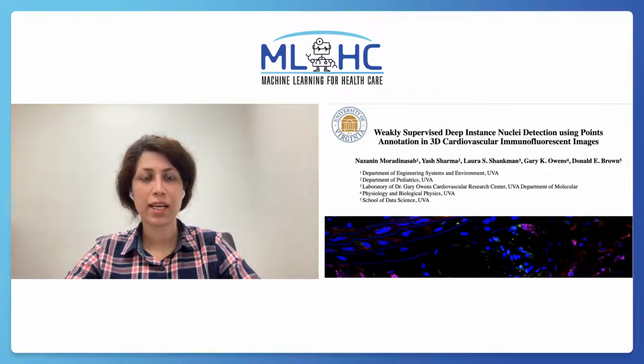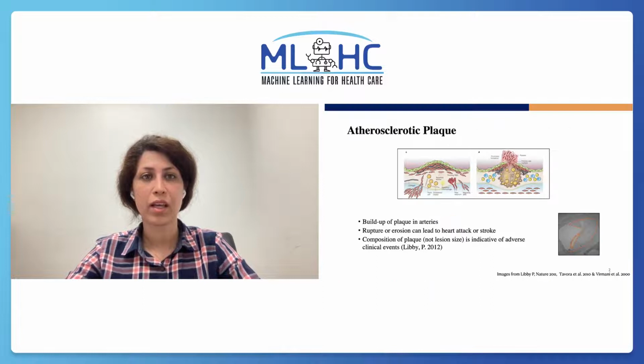Hi, this is Nazanin, and I'm going to talk about weakly supervised deep instance nuclei detection using point annotation in 3D cardiovascular immunofluorescent images. Atherosclerotic disease is a life-threatening disease.